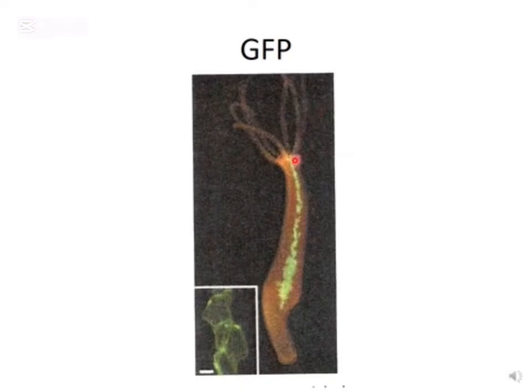The labeling here is done using GFP, which is green fluorescent protein, and this is actually a living specimen. So you can add the antibodies that are tagged with green fluorescent protein, then subject them to light, and the light would come back at a wavelength that would give you the color green. So you not only know the presence of the protein you are looking for, but you can also see its spatial distribution within the specimen.